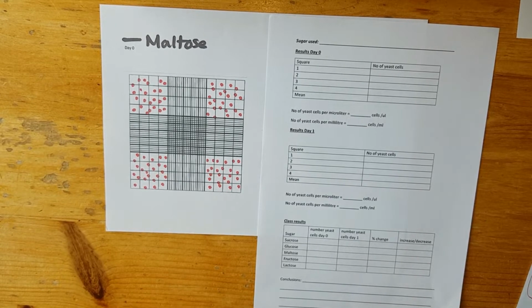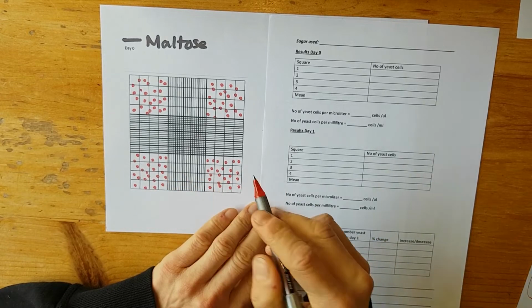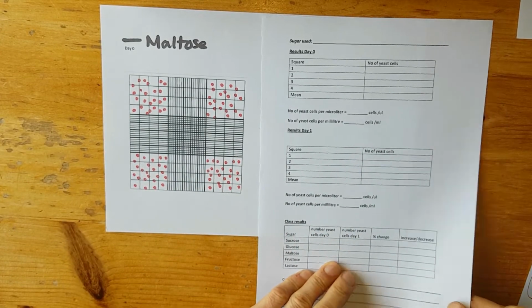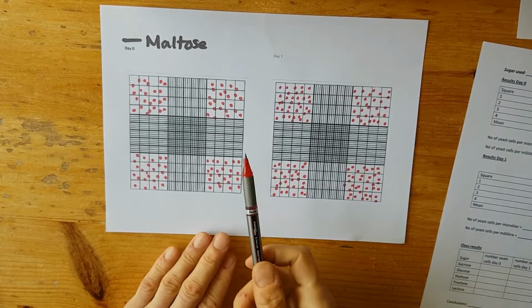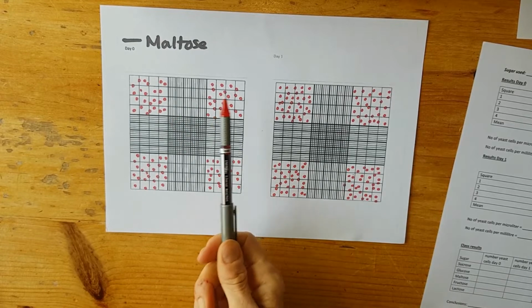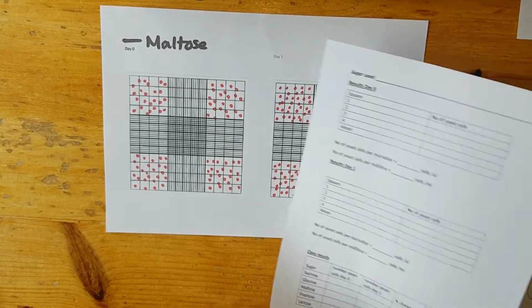Counting. I'll do one of the counts just to remind anybody who wasn't there in class what we did. So you have a sheet like this with results, and you have lots of different sugars. Yours are in black and white, but I've got a nice colour one here for different sugars. This one's maltose.